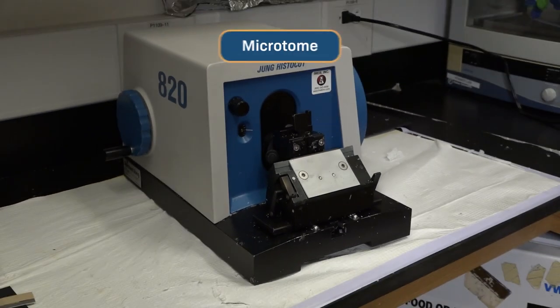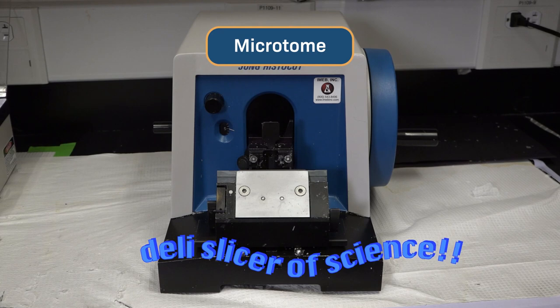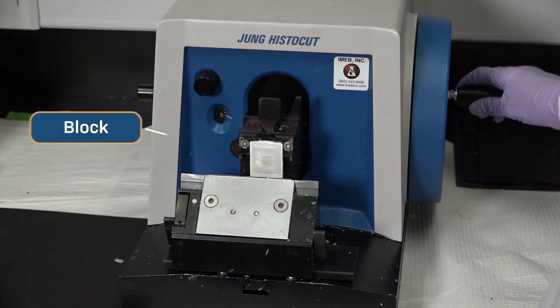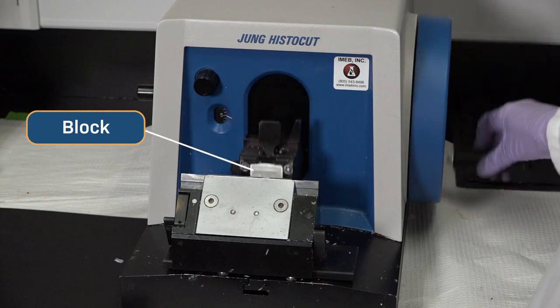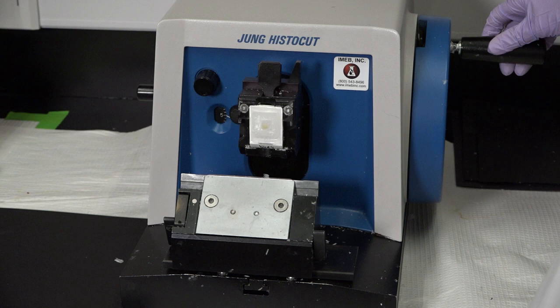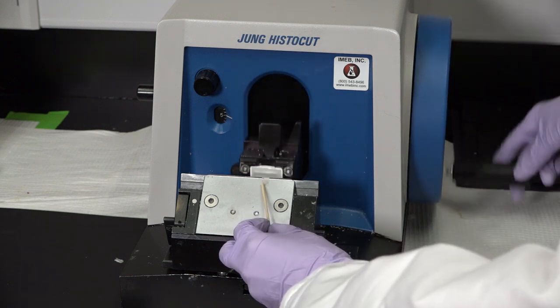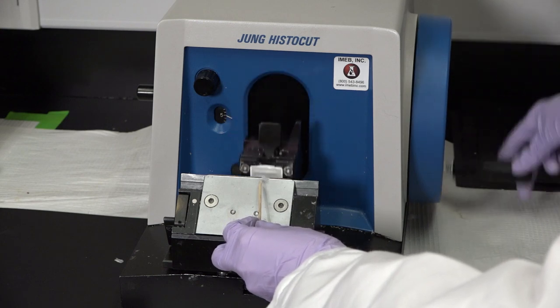Then I'll bring them to the microtome, which is basically the deli slicer of science. Let me show you what I mean by that. I secure the block in the microtome and then start to turn the wheel. And this is going to move the block up and ever so slightly forward so that when it comes down, this very, very, very sharp blade here will make a super thin slice of the block.